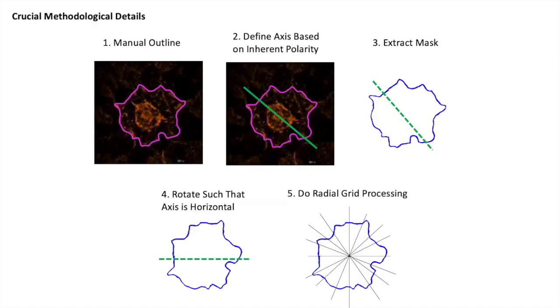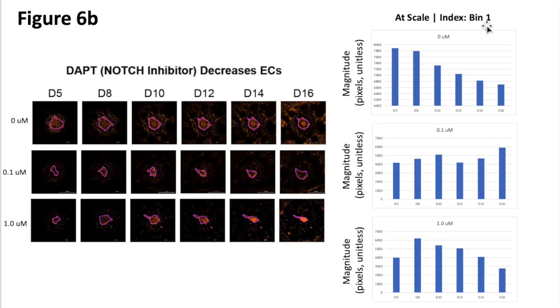For the inner rings, we also align them like we did before according to the axis that's inherent to the organoids. And in this way, we standardize all the orientations before we measure their shape, also through this radial grid system.